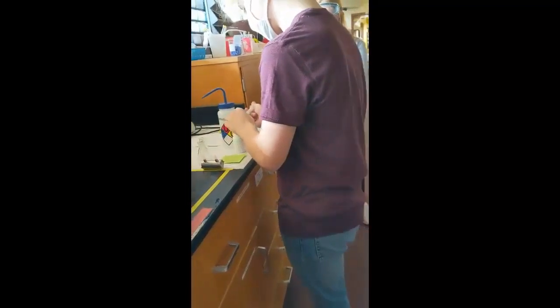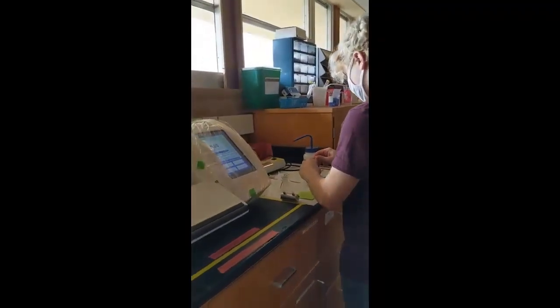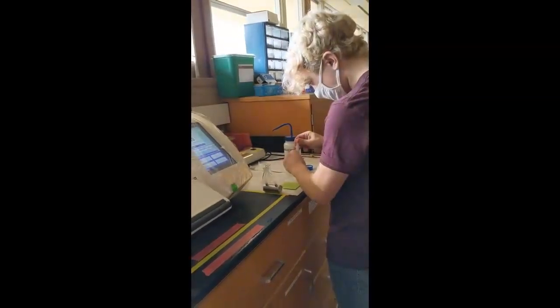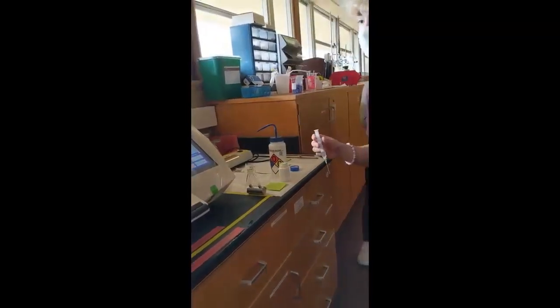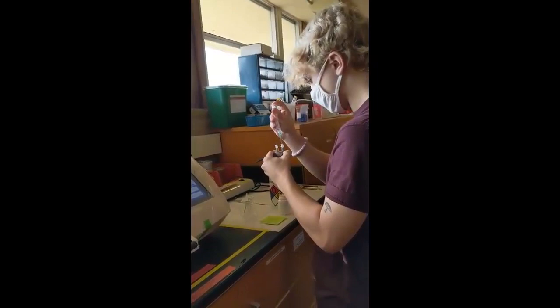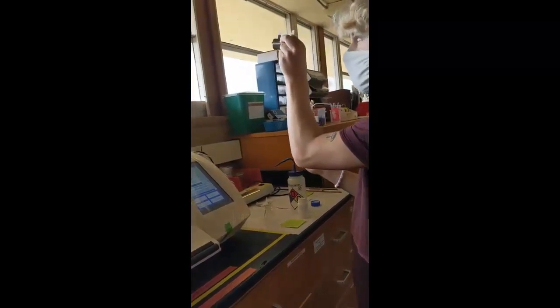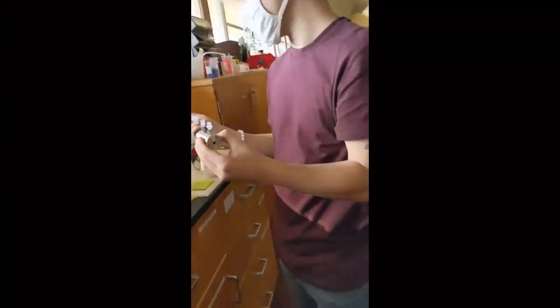And there's a cap on there. You're going to suction, you need at least 1 to 2 milliliters of liquid, because this thing holds about 1 full milliliter. So you're essentially going to do the same thing: fill it, and then check that it's filled. It might squirt out a little bit on the top, and then check to make sure you don't see any air bubbles, because if you do, we're going to have to get air bubbles out. Then go ahead and put your sample in.